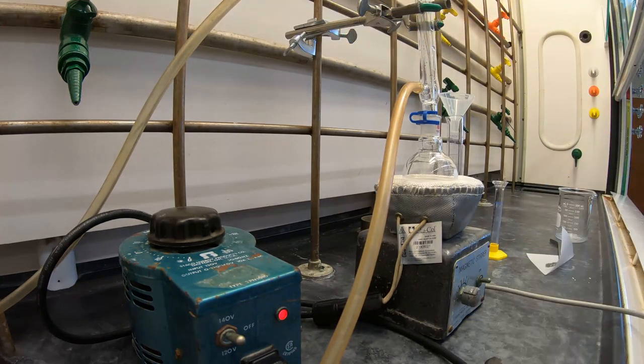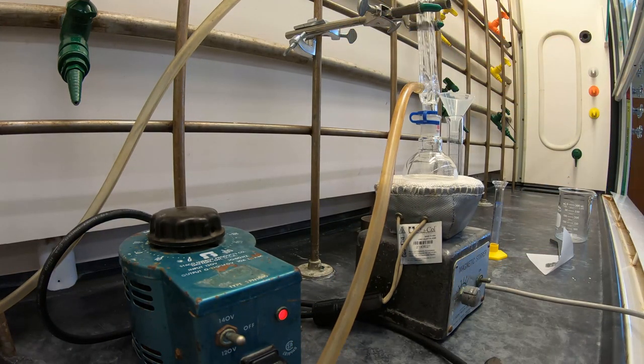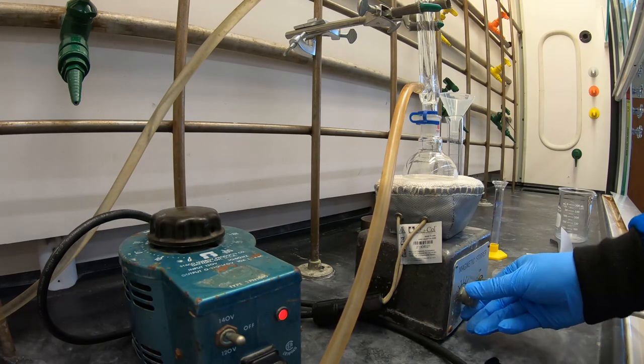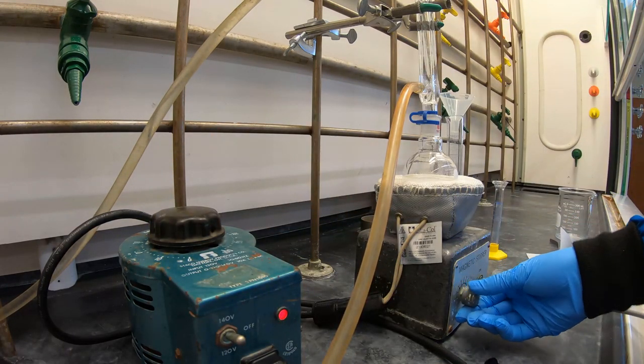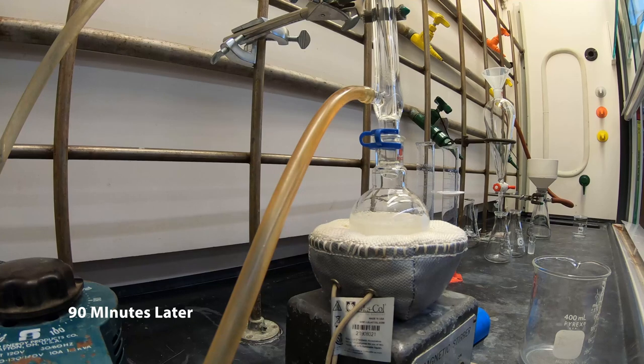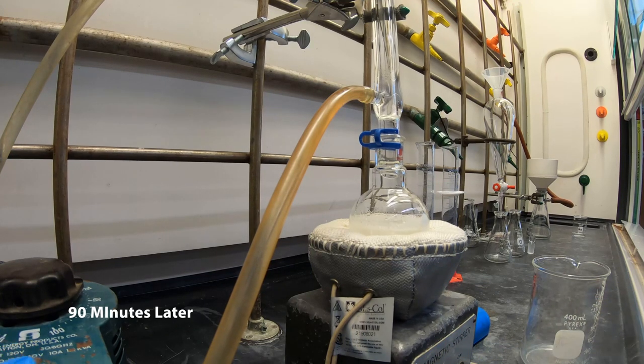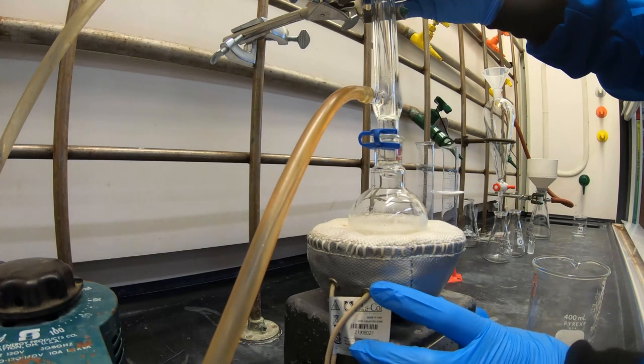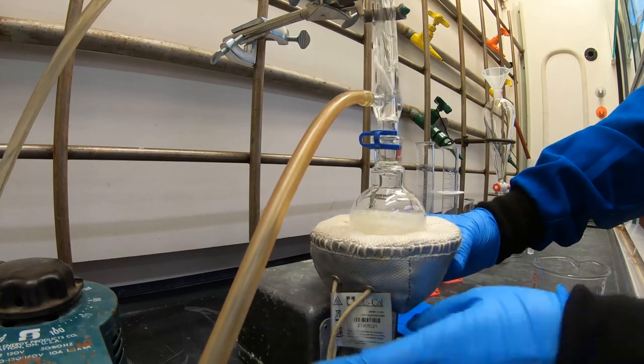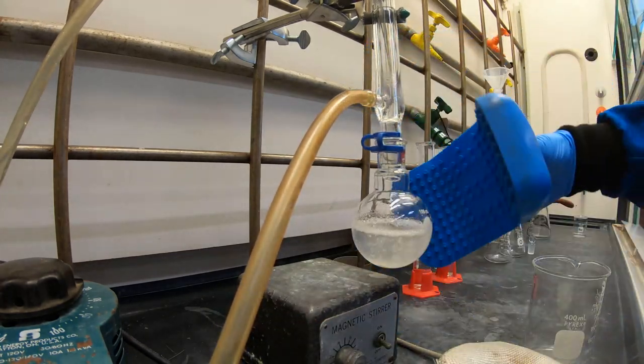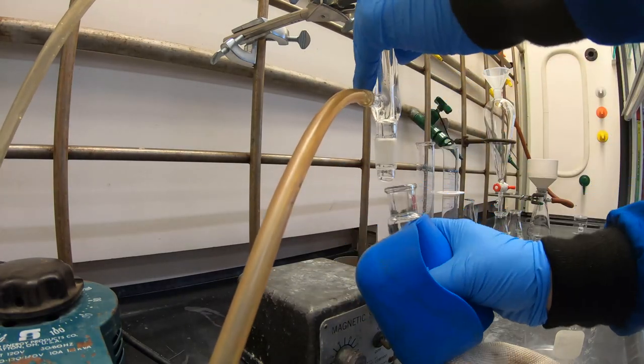Place your reflux system into a preheated heating mantle. You're going to start a vigorous reflux. Once you've reached reflux, allow it to stir for 90 minutes. Remove the heating mantle after 90 minutes and allow the flask to cool down to room temperature.